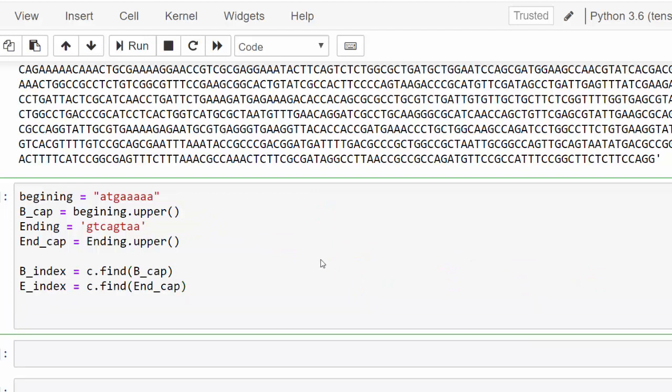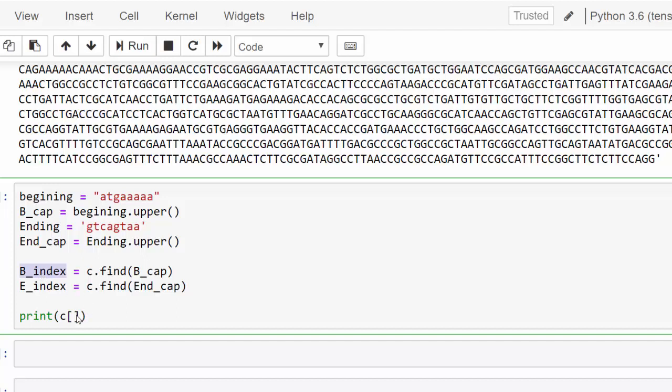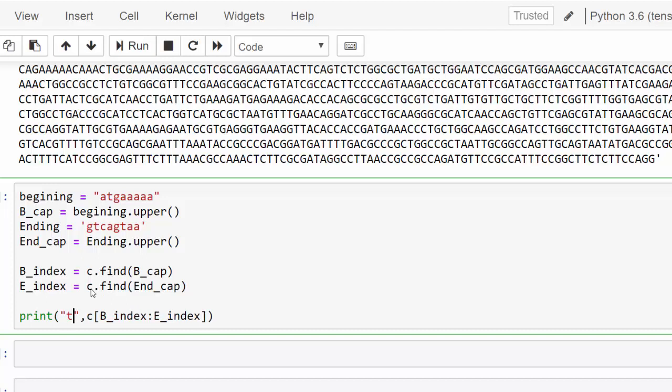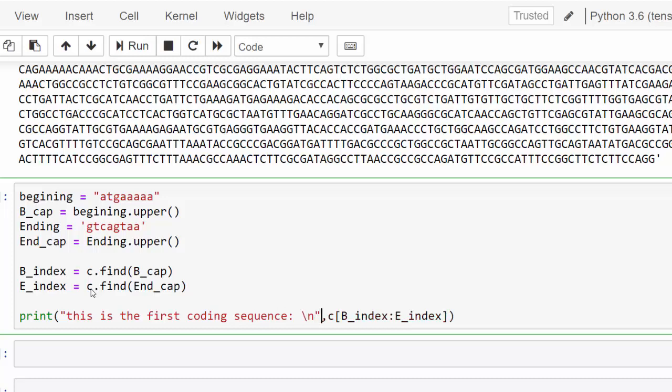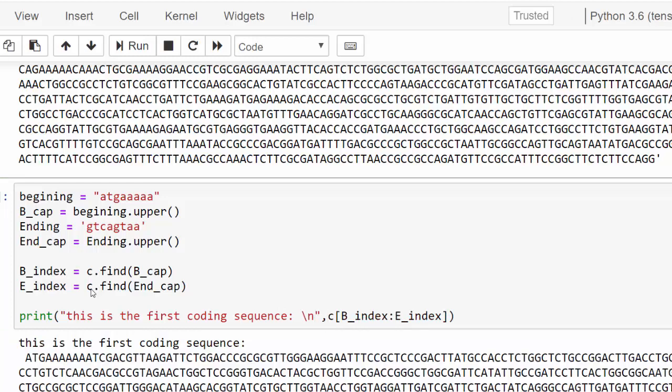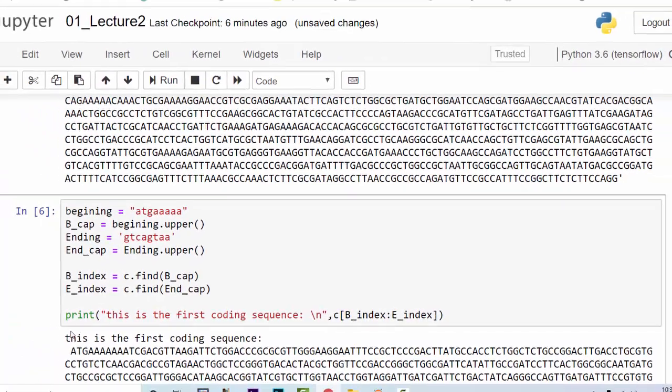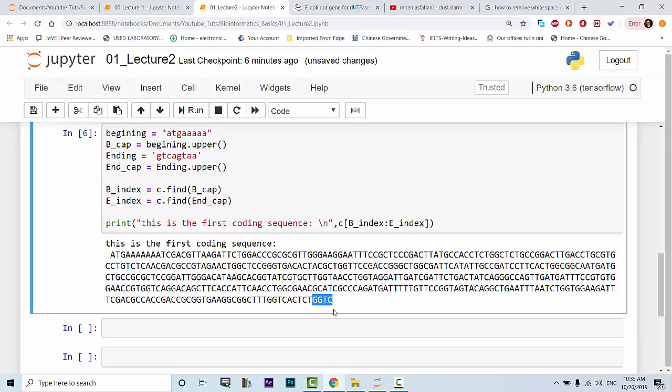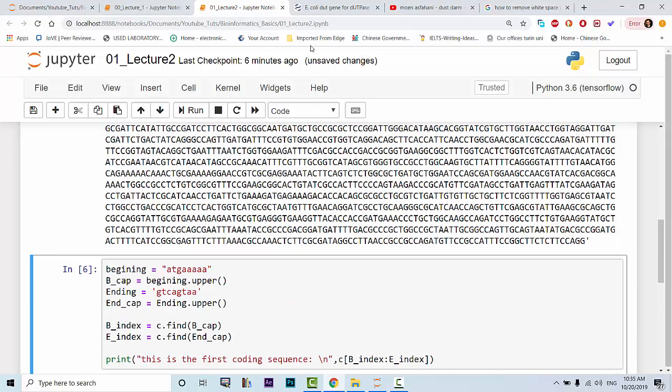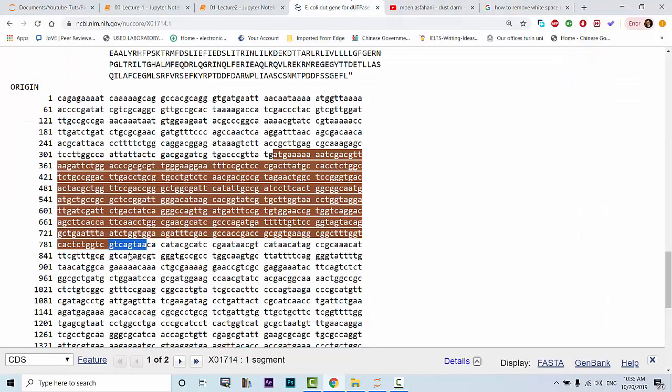Now we want to print out c. Print c from the beginning index to the ending index. So this is how you reference it basically. You can also say something here to tell the user that this is the first coding sequence. You can also have a return character to avoid mixing it. And it tells you this is the first coding sequence from ATG to GTC. So let's see why GTC. This is because GTC was the beginning, so it returns the beginning.